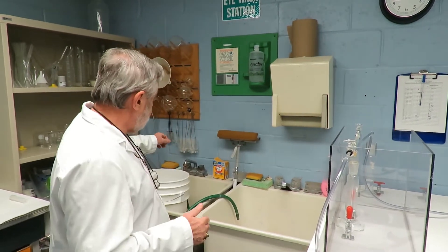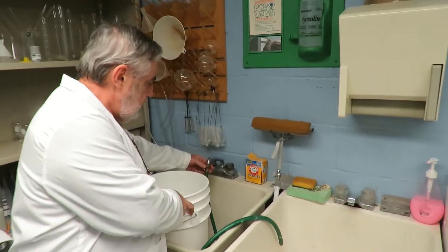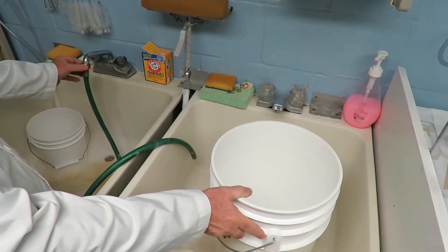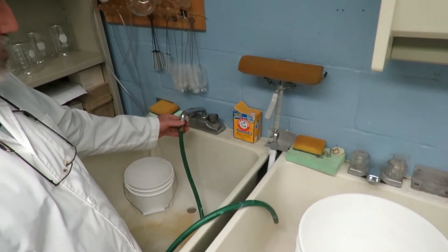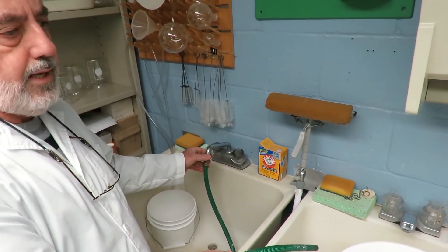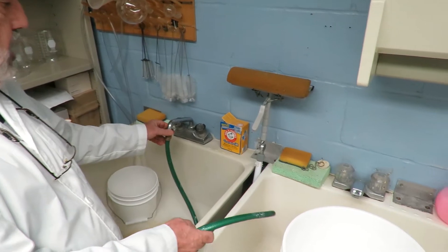You don't want that to happen — you want to sample before these water agitators. The best way to do this is to connect a hose to your tap, but make sure there are no aerators. It must come straight from the pipes themselves, as aerators will again release radon from your water.